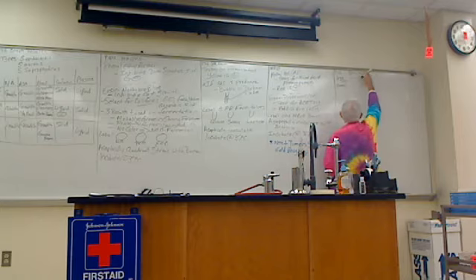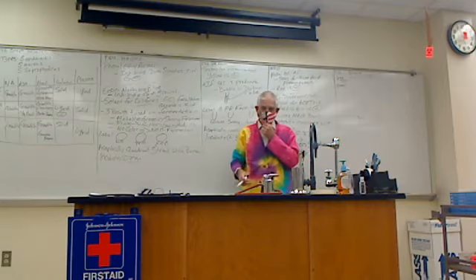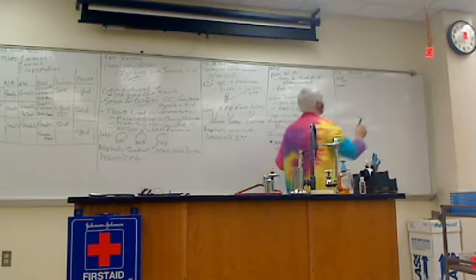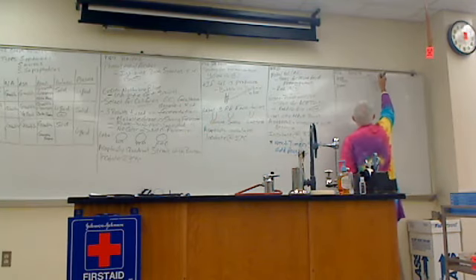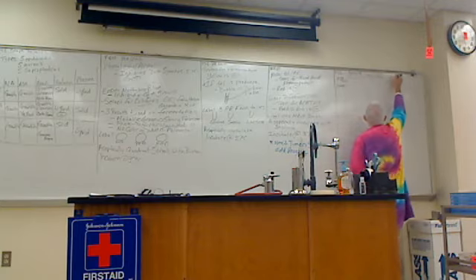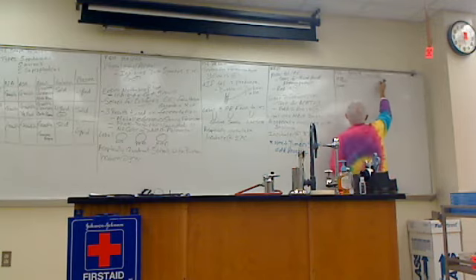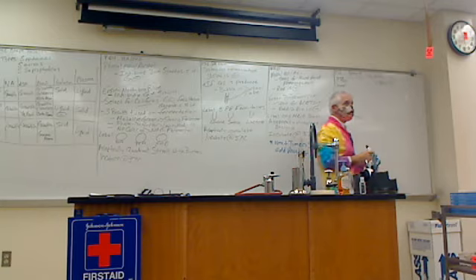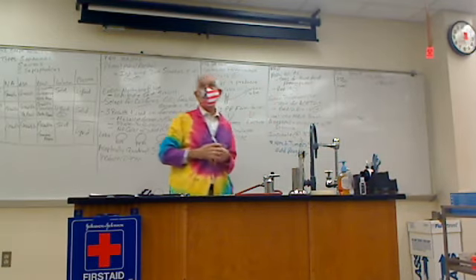Now, if the enzyme urease is produced, you're going to get ammonia plus carbon dioxide. And a beautiful bright pink is positive.